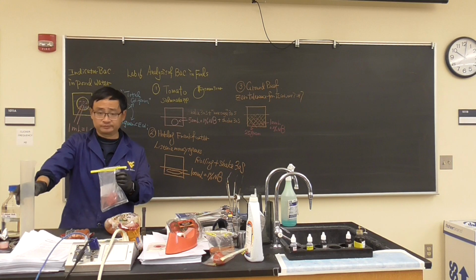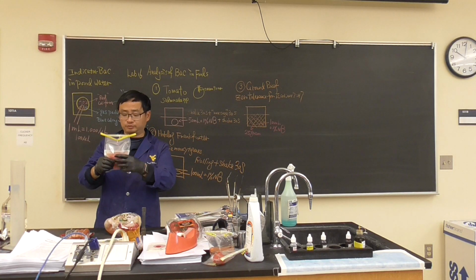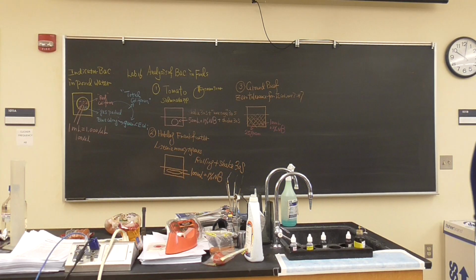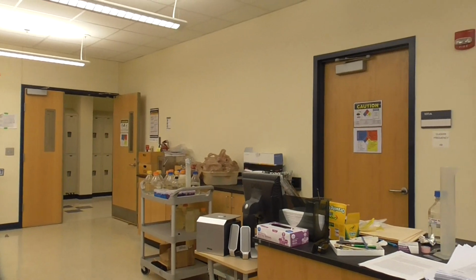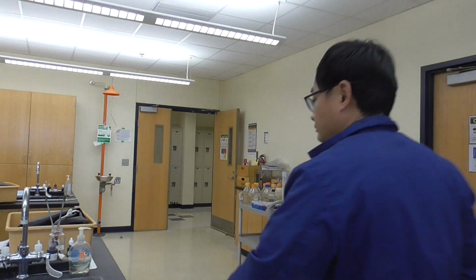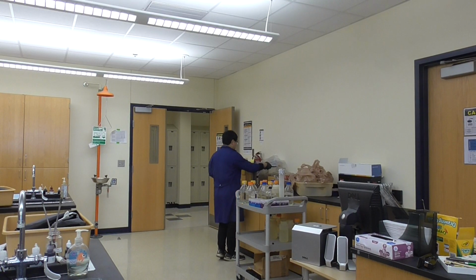What are we going to do? You think we're going to shake? No. You think we're going to hand-mix it? You're not going to homogenize it very well. So twist it a couple of times, and then look at what I do. The camera is moving. This guy, you never notice it. It is important.